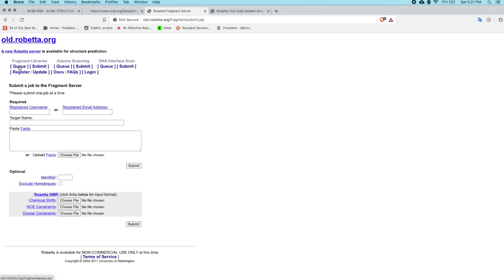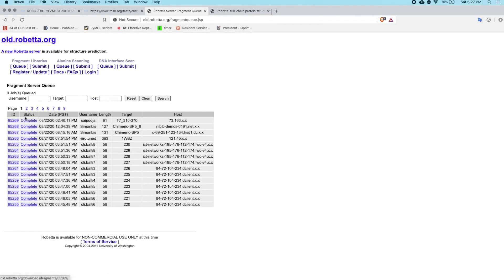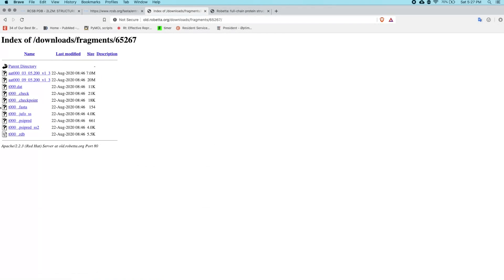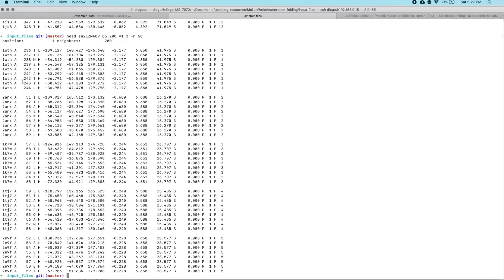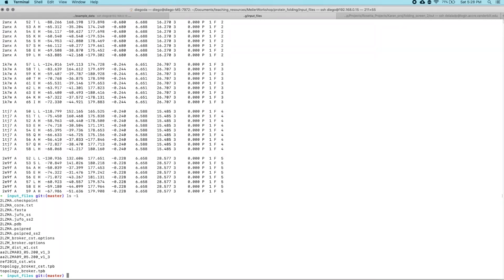You can pull up your job by going to the queue in the top left. It has a list of all the jobs that are either queued, running, or completed. You can click on any one, go to downloads, and you have all of the files there. Now everything from this directory that could be useful is already in the input files directory that's available to you, so you don't need to do this. Just go ahead and use the contents of this directory to do what you have to do, and you can use the Robetta server for your own test case. So we're just going to move right along and run this protocol. This is how you execute your ab initio run. All of the options are already in the options file, which is called 2lzmbroker.options, and it'll allow you to not have to type in all the options every time. Everything will be included in the options file, but it is equivalent to typing everything into the command line.